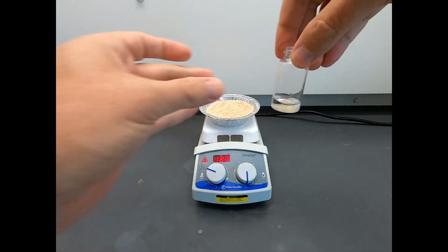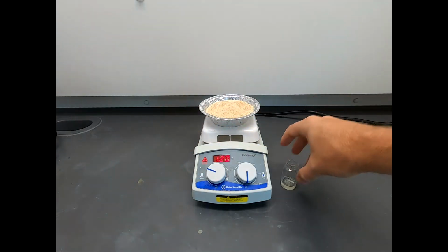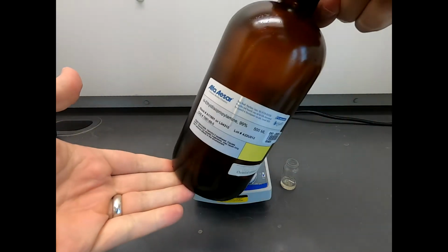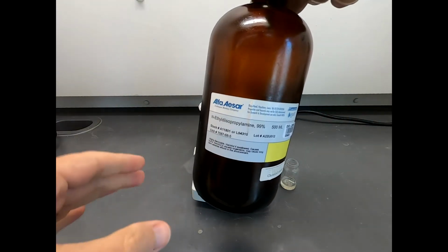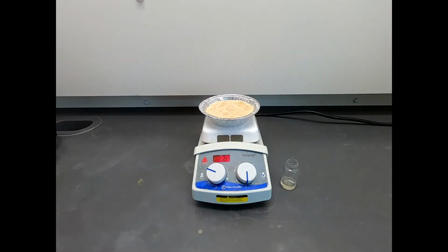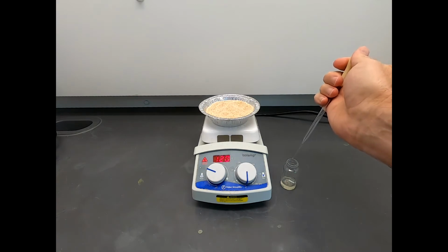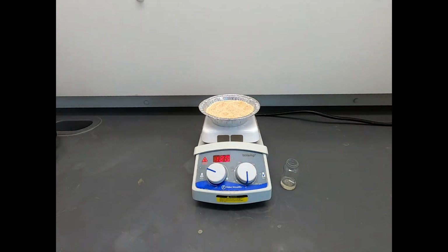Good. Now our goal is to get this to dissolve. In my experience, this takes a little work to get dissolved. It's not that it's not soluble, it's just kind of slow to dissolve. So I'm going to go ahead and add one of our other reagents, the Hunig's base. This is N-ethyldiisopropylamine. Honestly, I kind of question whether this is even necessary for the reaction, but this is what the procedure says to use. I don't want to reinvent the wheel, I just want to get some product, so I will add a drop of that to the reaction vial.